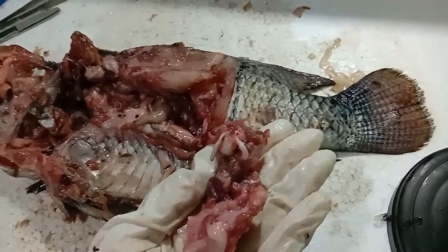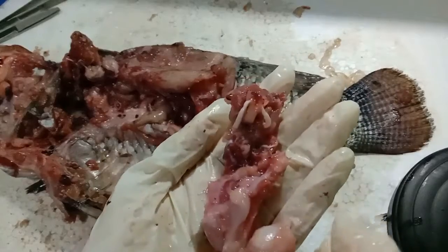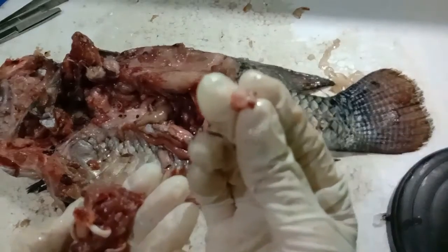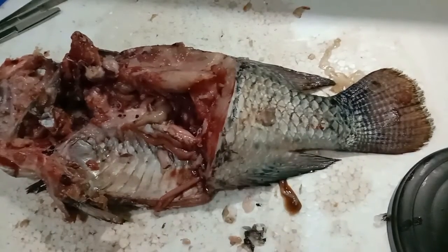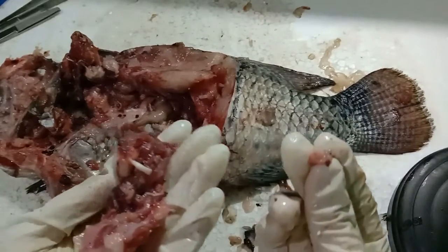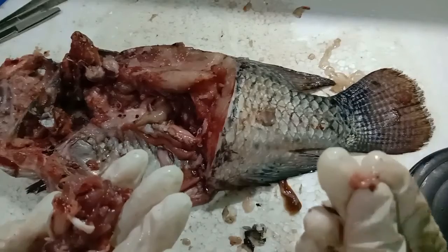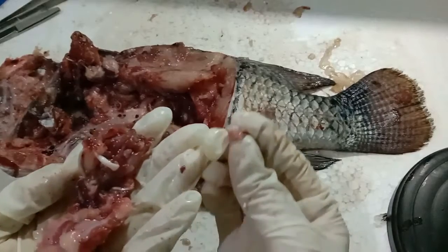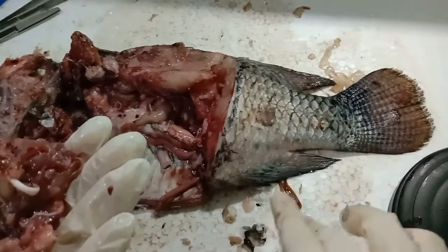So actually, I had cut the fish's upper head, but I think I failed, so I lost the brain and I found it here, one part of the brain. We know that the brain has the cerebellum, the optic lobes, and the cerebrum. I don't know if this is the cerebellum or the cerebrum. So I'm sorry, I kind of failed to see the full brain of the fish.